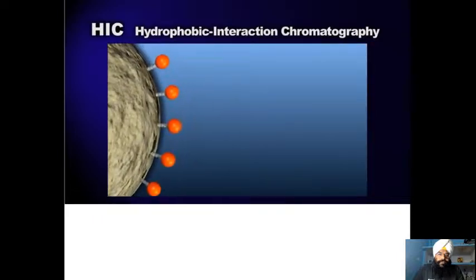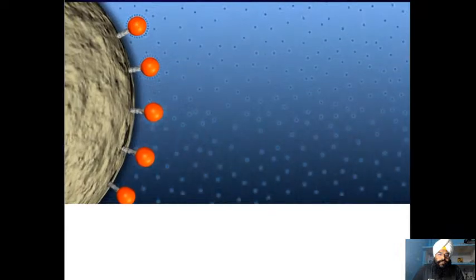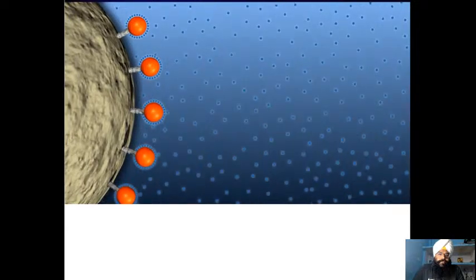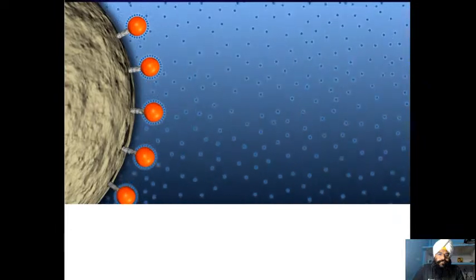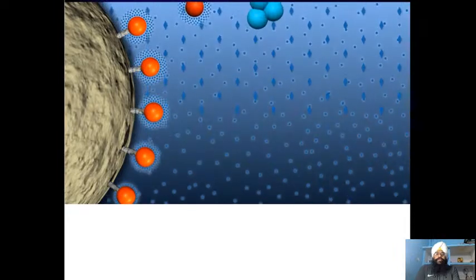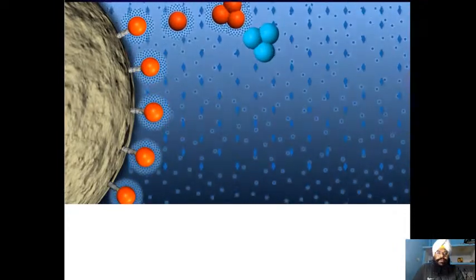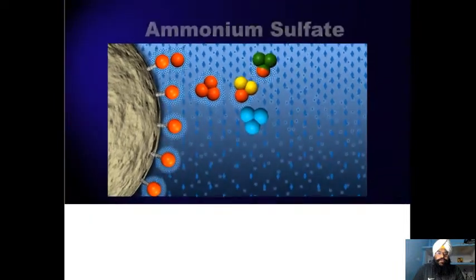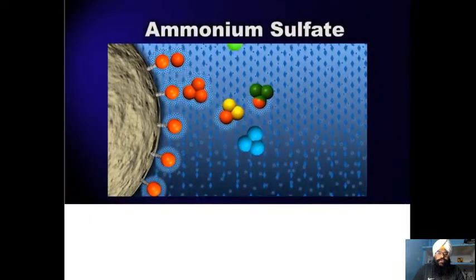Hydrophobic-Interaction Chromatography is based on the principle that hydrophobic chemicals on the resin surface will bind to hydrophobic patches on the GFP protein. In order for this to occur, the resin and protein eluate have to be in a high salt environment to remove the water shielding. The salt we use is ammonium sulfate.